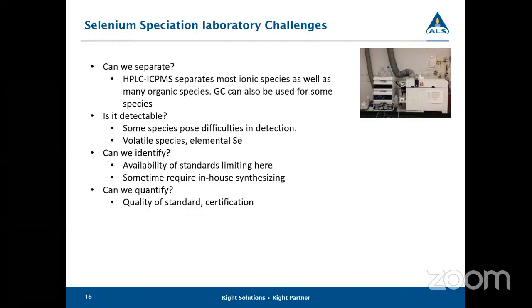and our standards don't have to be of the highest quality to simply identify and say, yes, this compound is present in your sample. But the last question is, can we quantify it? Can we give you a concentration with a good enough accuracy that is useful to you? That gets more complicated as we need to have standards that are certified. The best kind of standards would be certified externally, but they are also quite limited in numbers we can find. So sometimes we need to certify these standards internally ourselves.